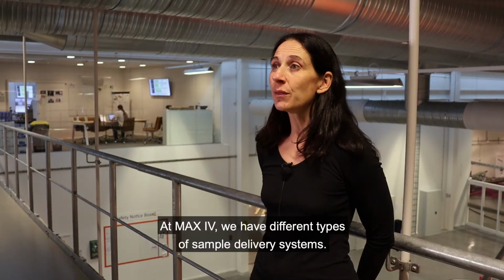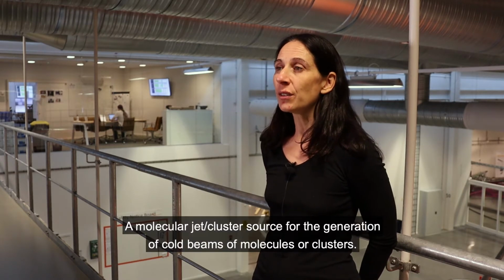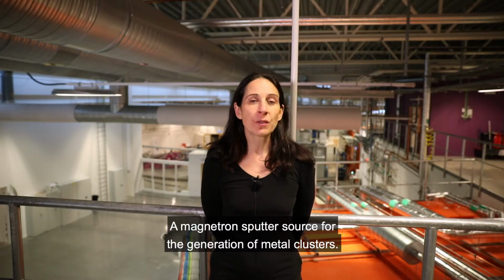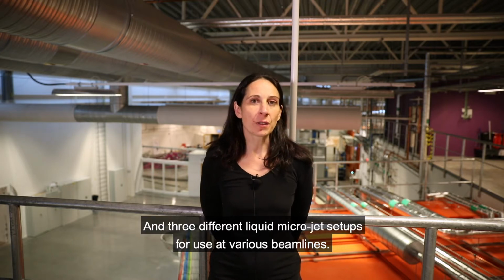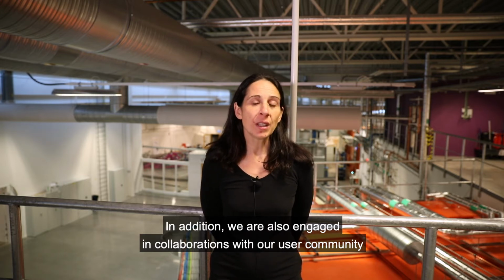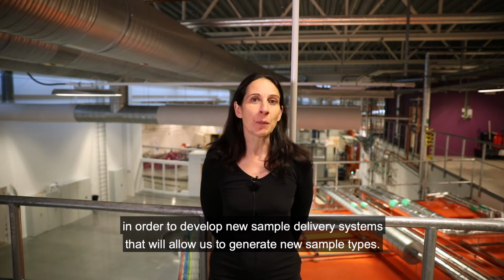At MAX IV we have different types of sample delivery systems. For example, a molecular jet or cluster source for the generation of cold beams of molecules or clusters, a magnetron sputter source for the generation of metal clusters, and 3 different liquid microjet setups for use at various beamlines. In addition, we are also engaged in collaborations with our user community in order to develop new sample delivery systems that will allow us to generate new sample types.